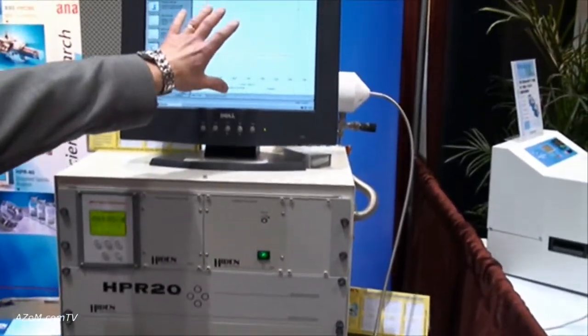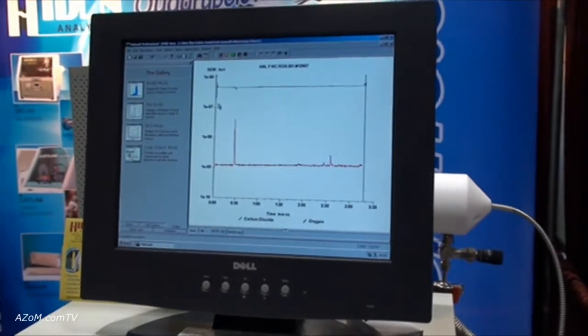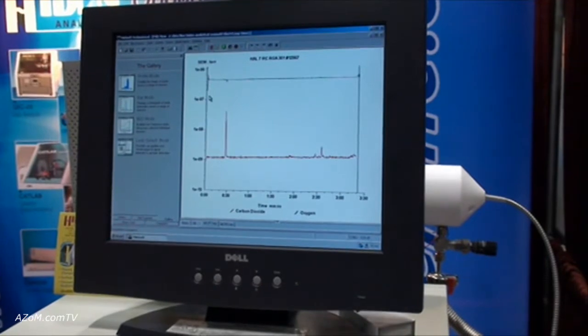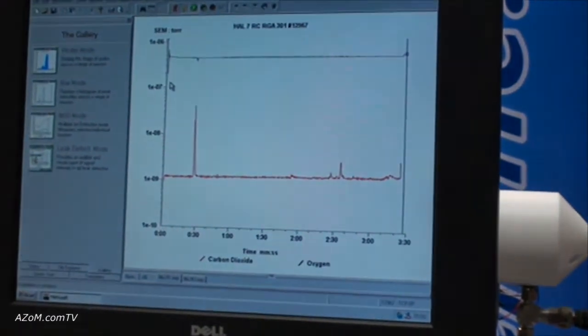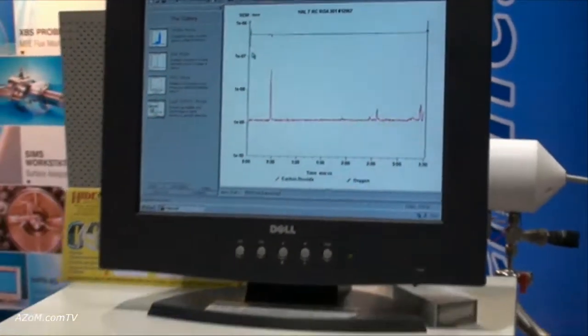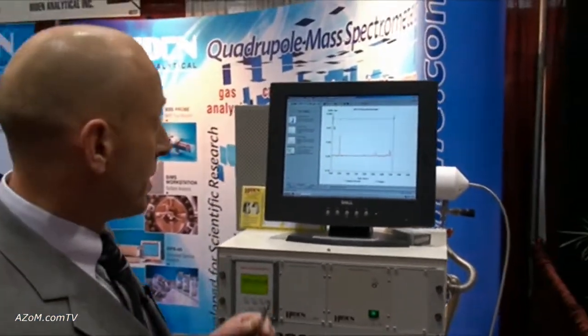What we can see on the screen at the moment is the instrument scanning, looking at both CO2 and oxygen. We have a cycle time of up to 500 channels per second, so a very fast response system. If I just demonstrate by breathing into the capillary here, we can see the response time to both CO2 and oxygen — the response time is of the order of 300 milliseconds.